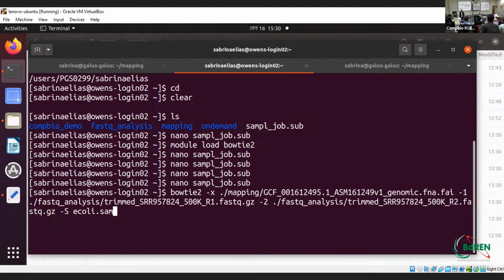So you can remember the command. It is already in your history, right? That is from when we aligned the reads with the reference. So we put it in bowtie2, then -x, then the reference file. You remember that there was BT2, BT3 something, but we will take the FAI.